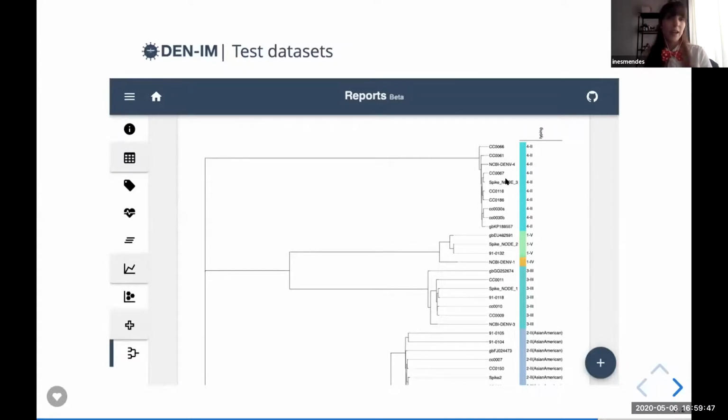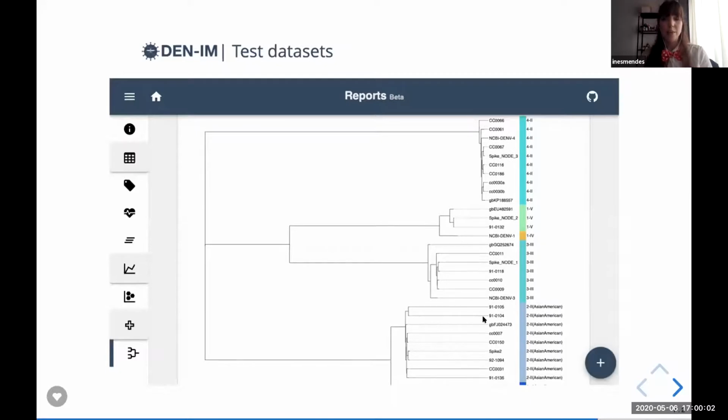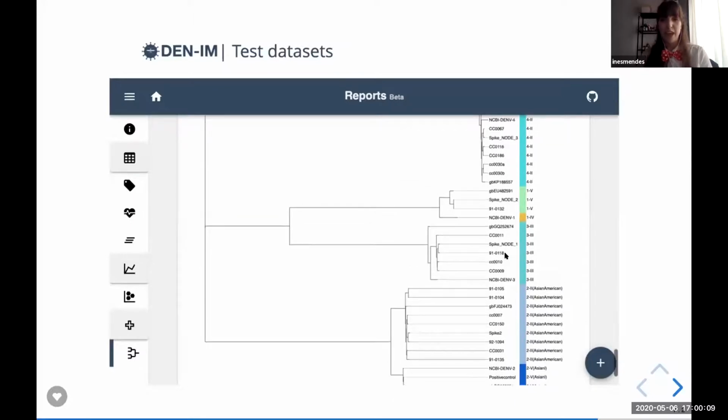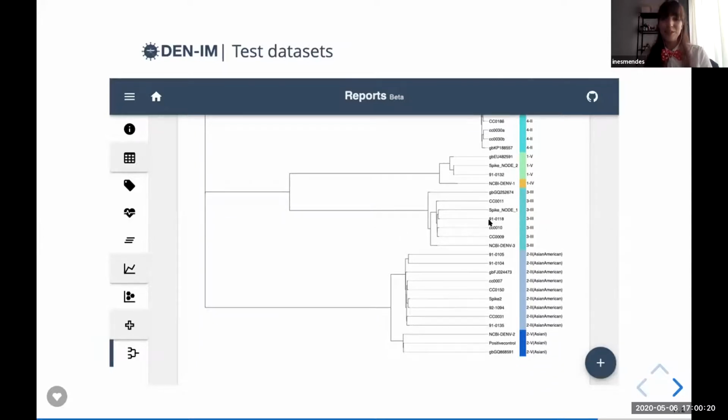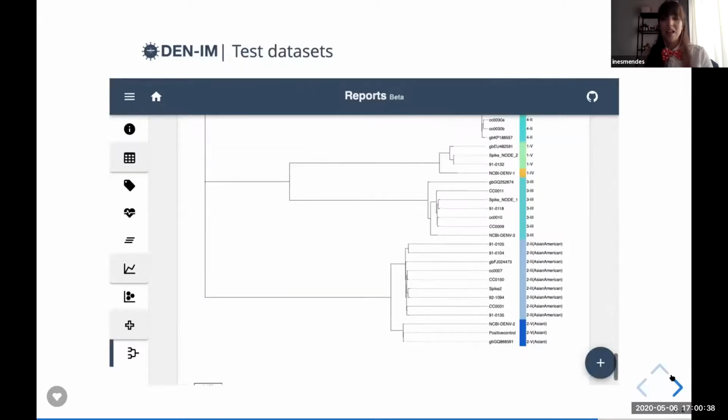You can ask our pipeline not to include the NCBI references, or not to include the closest match in our typing database. But here it makes it really easy to see the collection that we had and the relationship between the viruses in our collection. So we mostly had serotype 4, genotype 2, serotype 1, genotype 5. Here is the NCBI one, so it's different, it's this genotype 4. Serotype 3, genotype 3. Serotype 2, genotype 2, also known as Asian American. And again, our positive control was serotype 2, genotype 5, also known as Asian 1, so they were a bit different.